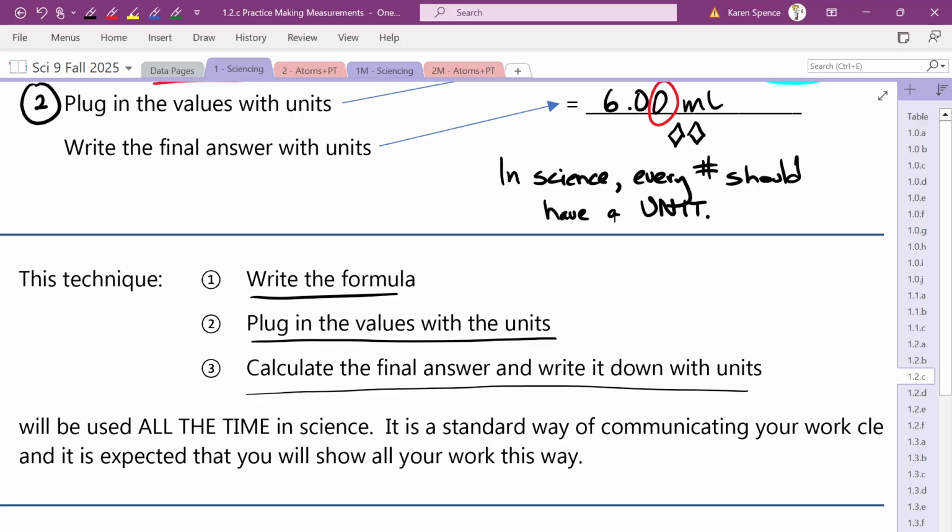Okay. So I'm going to hand this out, and you're going to do your best to follow the written instructions. All right. Part of what I'm going to be looking at is, can you follow written instructions? Everything is going to be water. Do you need to wear the safety goggles if we have water? If it's just water, no.